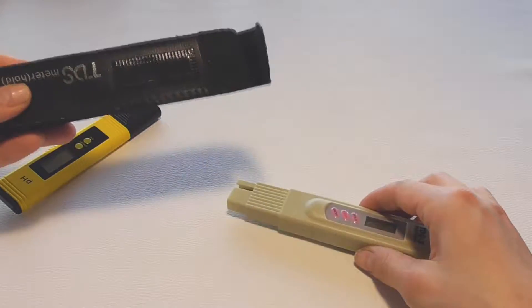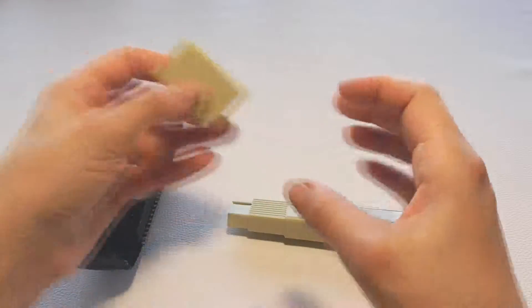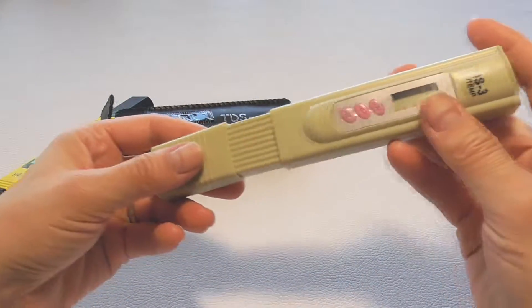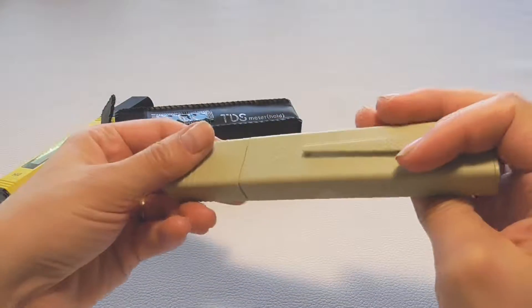So what is pH and TDS and why do you need to test them? A TDS meter indicates the total dissolved solids, the concentration of dissolved solid particles such as salts and minerals.